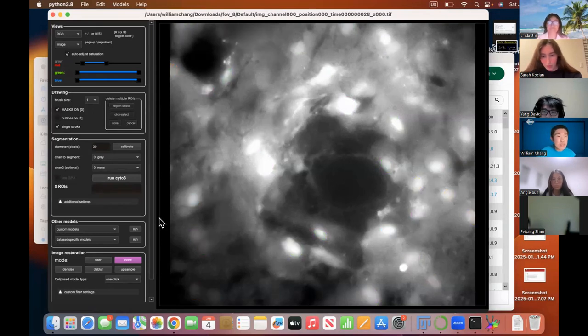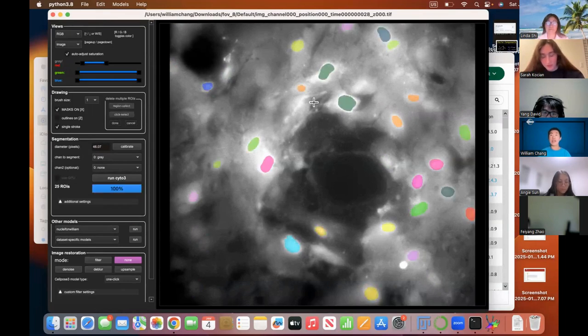For example, let's use this model called Nuclei for William, because I was playing around with Cellpose during the summer, and let's see how it works. This is based on the previous work and the masks that I drew, and this is a new image, and let's say I run that model. It should automatically draw some masks for me and quantify how many cells there are here.